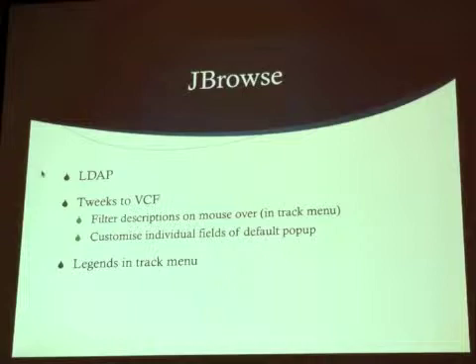There's a few nice things that we can add to the VCF formats, especially if you've got filters on your VCF data sets. At the moment, it shows the filter abbreviation. You might want a long description available to your users. The first thing I got asked by my scientists was, what does that mean when it's in that colour? If in the track selector menu, the editor menu, you had the ability to pop up a legend for what your current configuration is, you'd have to do a lot less documentation for users if it's just pulled out of the configuration file. That red is an unpaired read from a BAM file.